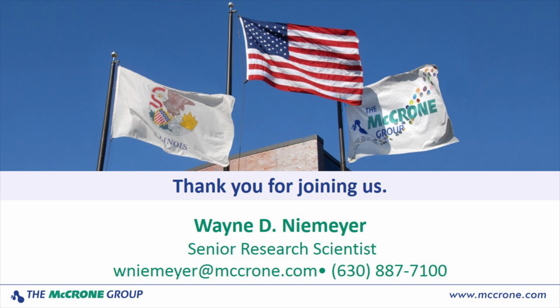Let's see, Scott, is coaxial illumination significantly more expensive than ring lights or oblique lights? I don't know, Chuck. Well, I mean, you have to buy the box, the light source for either one, and then it's a matter of plugging these things in. I would think they're more expensive.